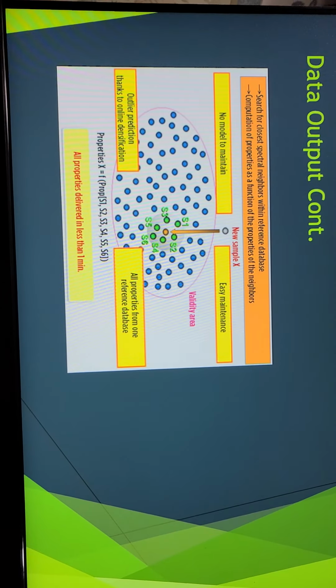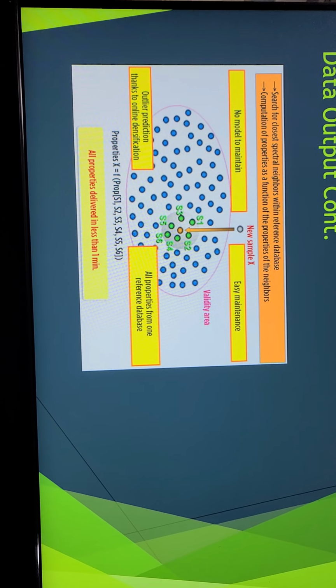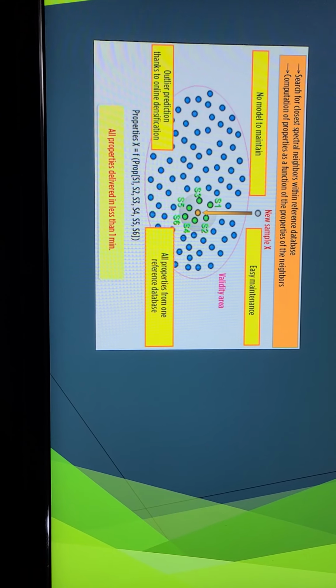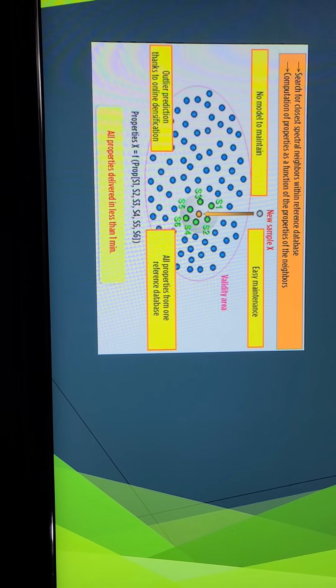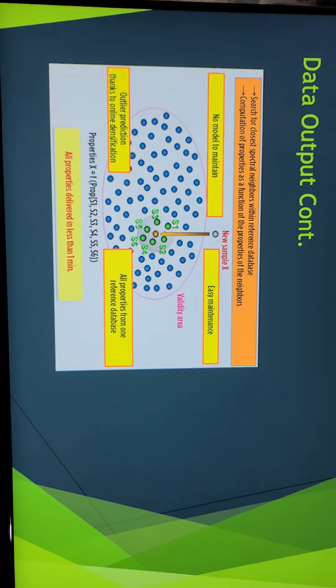And then on the next slide, I have another view of another top NIR. How would that look like? So basically, you find your unknown, and it gets put into this envelope, into this little cluster, and then it just looks at everything around your point, and finds this little cluster, and from what your reference and calibration samples were, it knows what those are, and then it can predict yours based on what it knows of everything else.